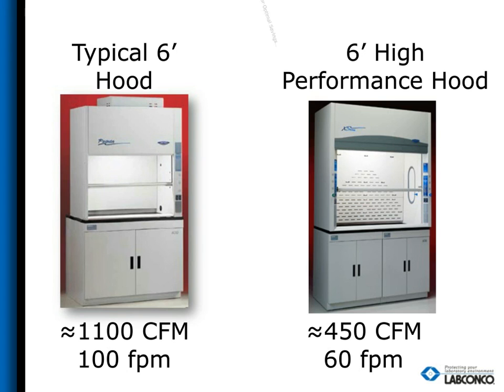So keep in mind, this is for optimal savings. You're going from 100 feet per minute to 60 feet per minute. So on the next slide, we're going to look at this a little bit more conservatively even.